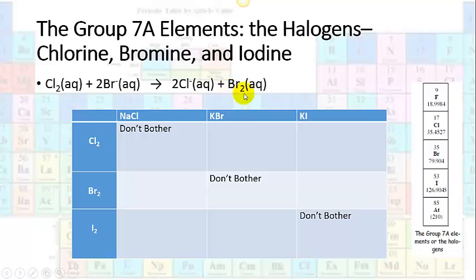So how do you know if this reaction takes place? Well, you know what the chlorine looks like in hexane, and you know what the bromine looks like in hexane. And when you mix these together in a test tube, it's really important that you swirl it. And you keep swirling it, and you make sure that it's fully mixed, fully reacted, and that you have dissolved in the hexane the halogen that is in the elemental form.